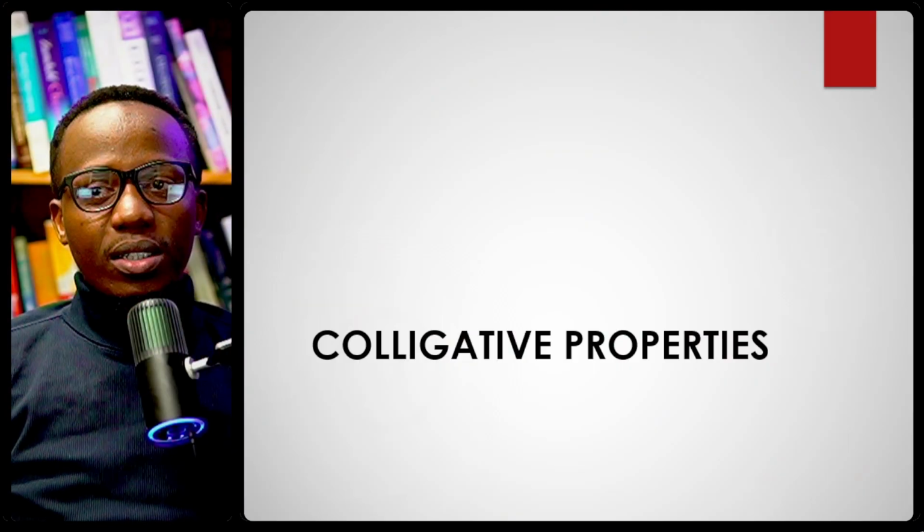Today, we're talking about colligative properties. Now, today's lab is a little fun lab where we're going to be using only salt, water, and ice. But I'll show you that you can do a lot of cool experiments with just this setup. And before we get started, let's talk a little bit about colligative properties.